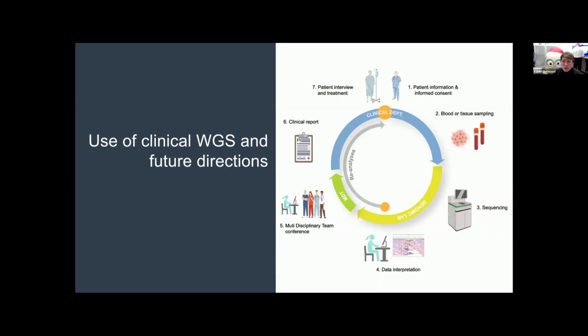And yes, whilst ongoing improvements in long read accuracy and error correction are coming, and costs are coming down, and they're expected to make fully phased haplotype resolved profiles really easily accessible, we still have to understand the underlying complex interactions between all of these things, and integration of these data with structural and epitope level information, as well as AI-driven risk prediction, all these cool tools everyone's been talking about. These will likely broaden the clinical impact of sequence-based HLA typing beyond the current match paradigms.